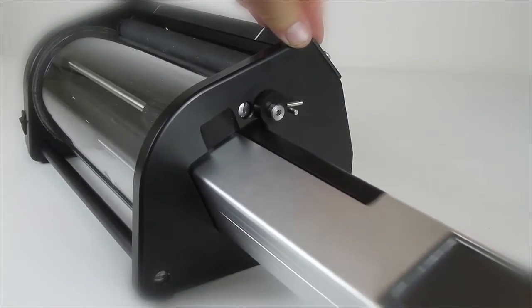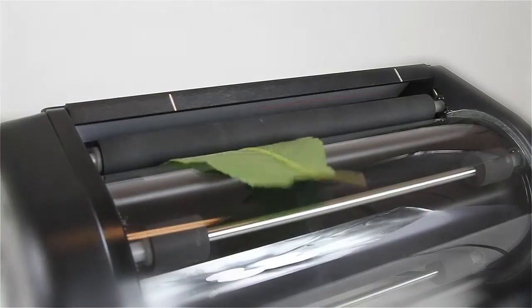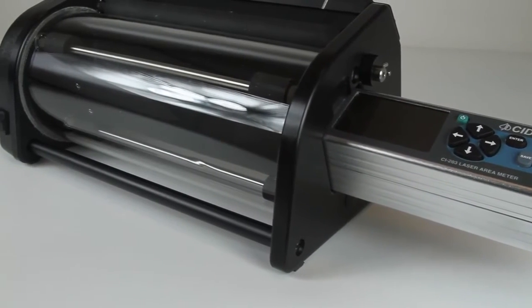For measuring large numbers of detached leaves, an optional conveyor attachment is also available. The conveyor attachment is a perfect solution for whole plant high-throughput phenotyping studies.